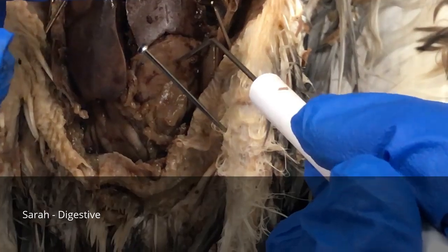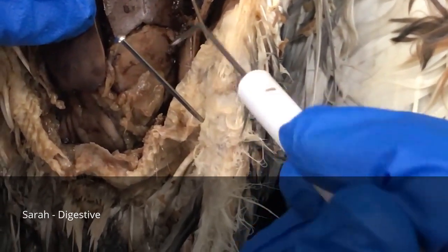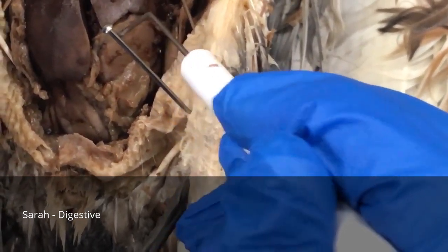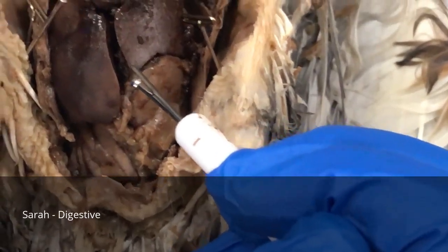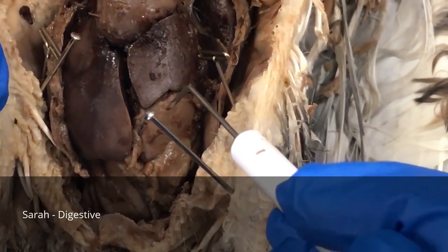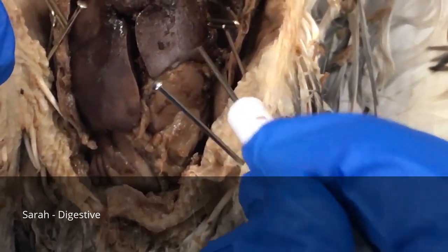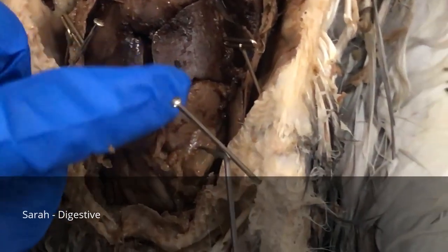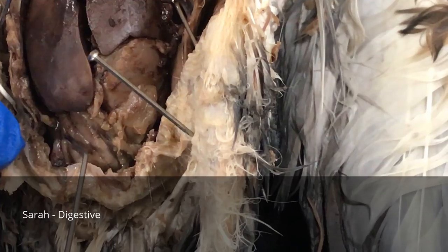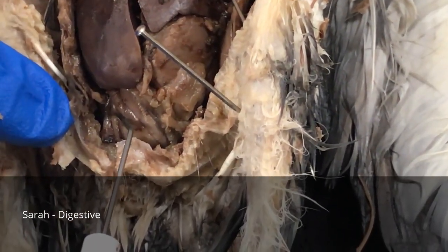The gizzard is lined with a rough keratin-like layer called koilin, and if I touch it, it's really, really hard. This is done for mechanical digestion, and sometimes it contains grit, which is small stones that pigeons pick up, and the stones help grind the food together so it can be further broken down mechanically after it's been chemically digested. And then after that, it goes through the intestines, which is down here, and in the intestines is where we get our nutrient absorption after the mechanical and the chemical digestion.